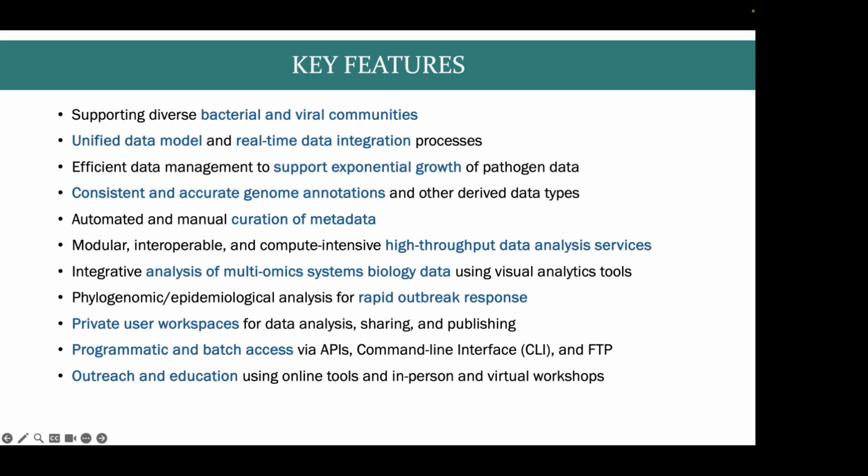and have modular, interoperable, and compute-intensive high-throughput data analysis services, and that's what we're going to talk about a little bit more today. Then we have integrative analysis of multi-omic systems biology data using visual analytical tools, and phylogenetic and epidemiological analysis for rapid outbreak response.